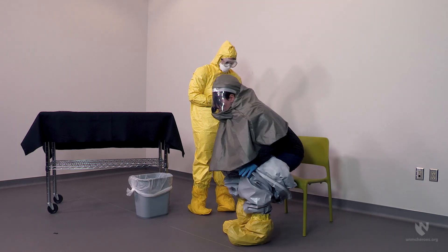At this point, the Decon team member can sit. The Decon team member can assist in the removal of the suit, but they should try and touch only the inside portions of the suit with their inner gloves.